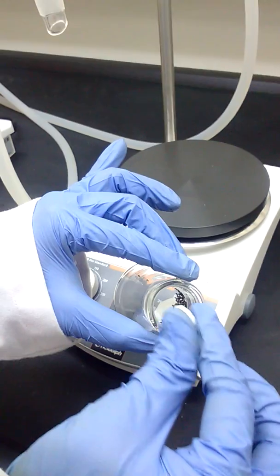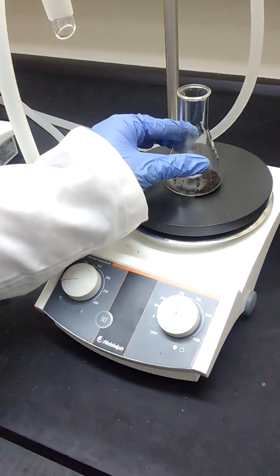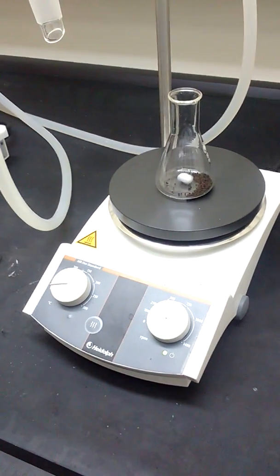To this, add a magnetic stir bar and place the conical flask on a stirrer.